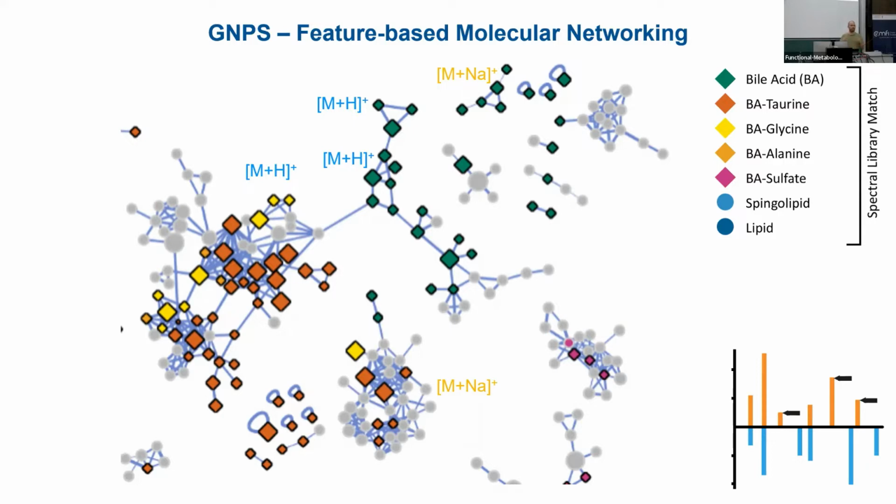Not only height as an alternative way of measuring abundance, but also characteristics like the width of a peak, or the width at half height of the peak, the shape you can report, like the asymmetry factor and stuff like that. So you can export everything if you want to. We didn't showcase it yesterday, but for advanced users, it's really convenient to have that information accessible.